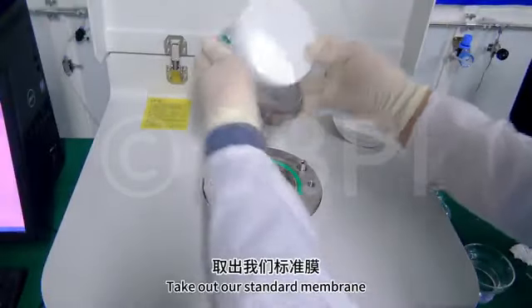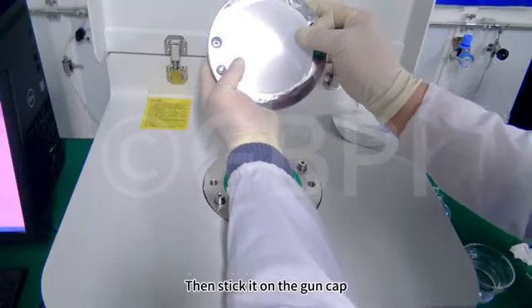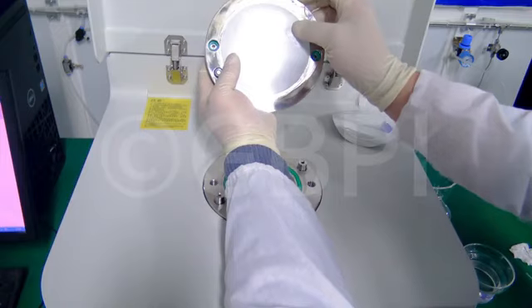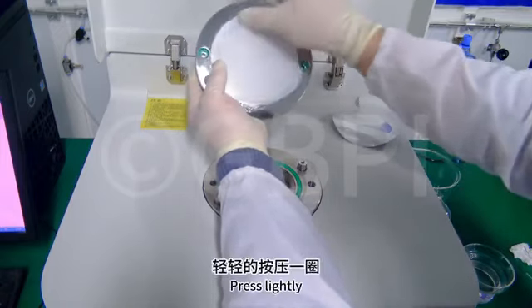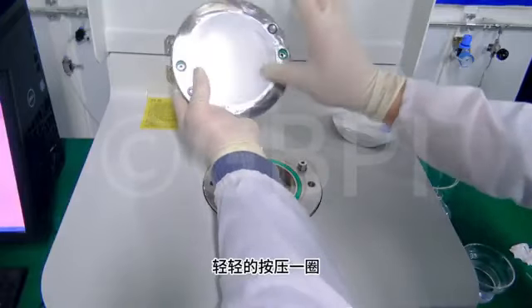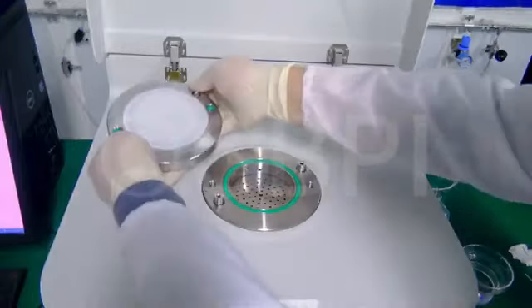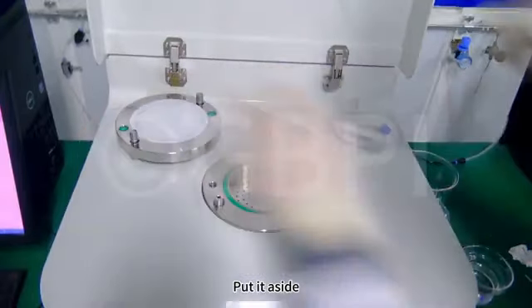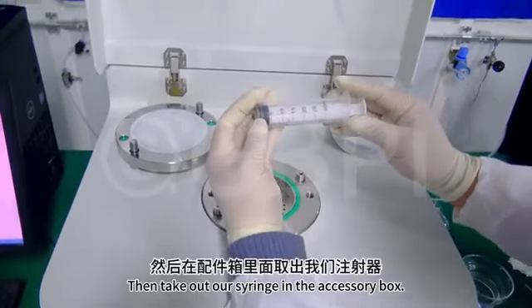Take out our standard membrane, then stick it on the gun cap. Flatten it. Press lightly. Put it aside. Then take out our syringe in the accessory box.